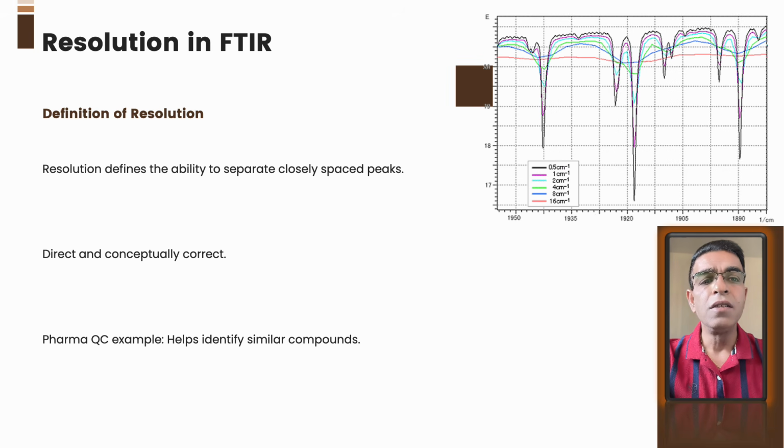Then add the balance point. So if we use a higher resolution, we get sharper and better separated peaks. But at the same time, higher resolution also increases the scan time. This answer works well because it shows you understand both the advantage as well as the practical limitations.